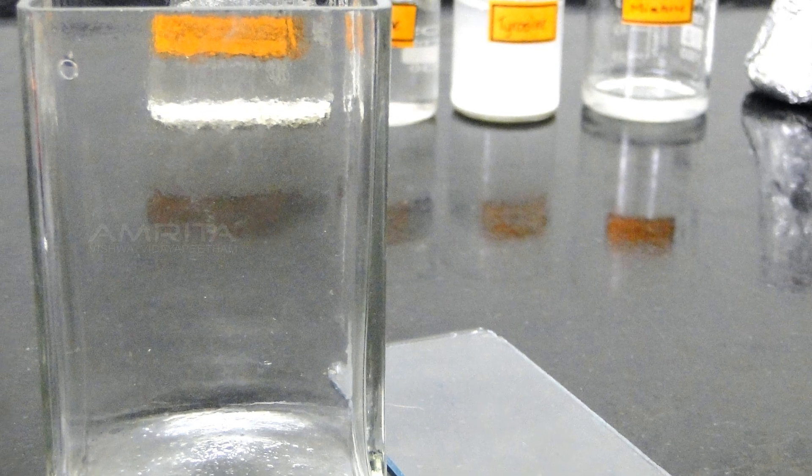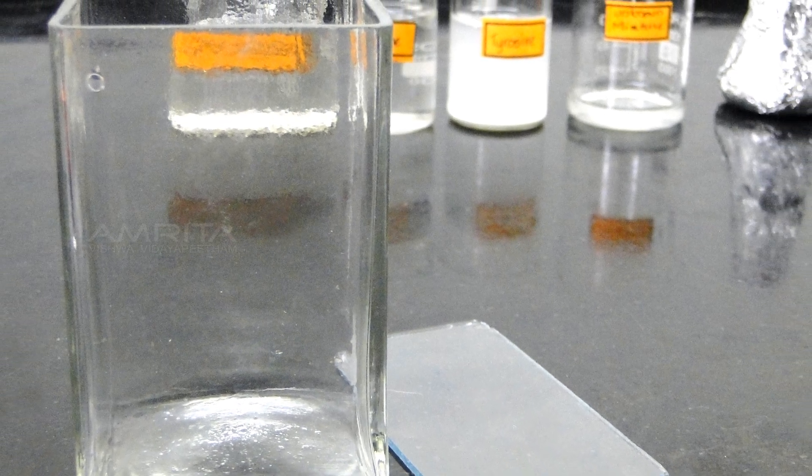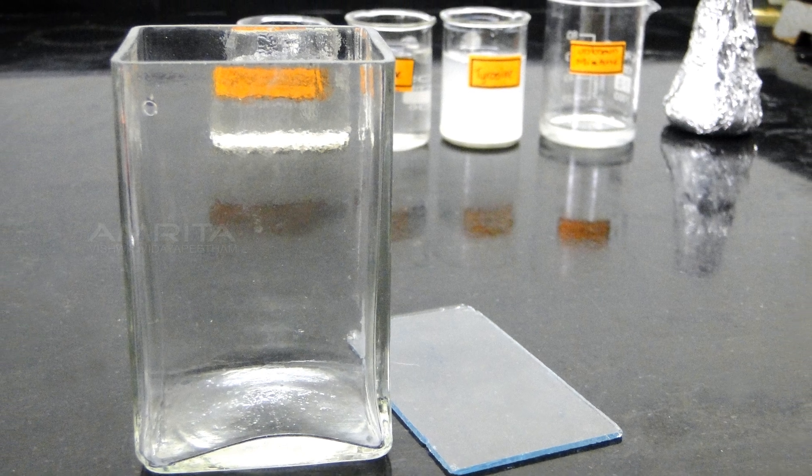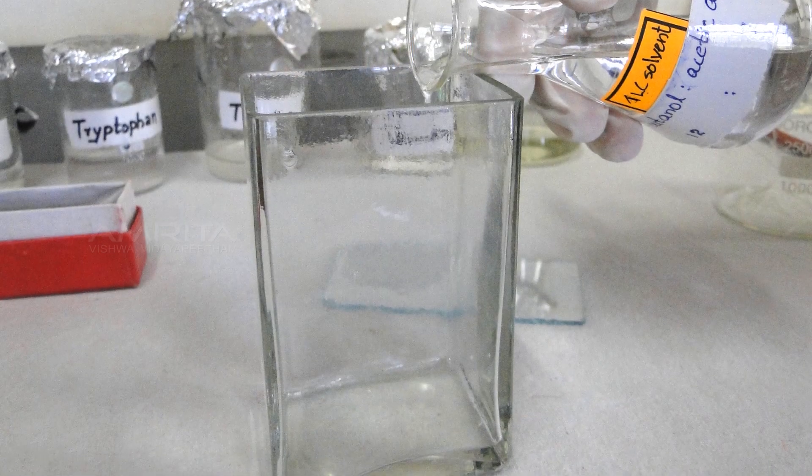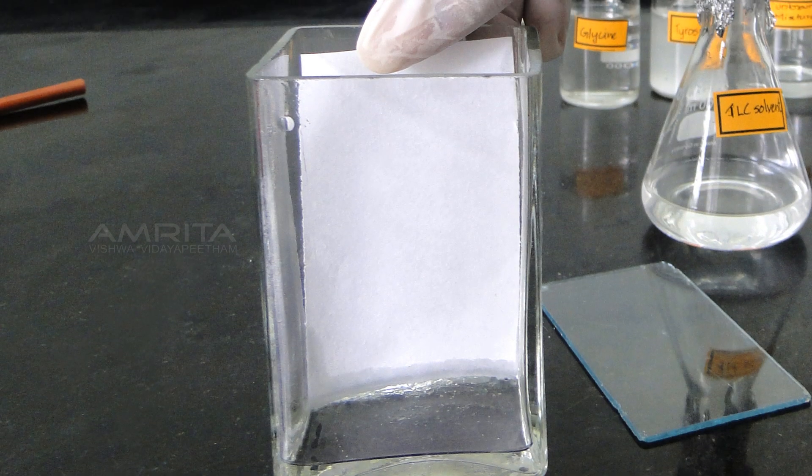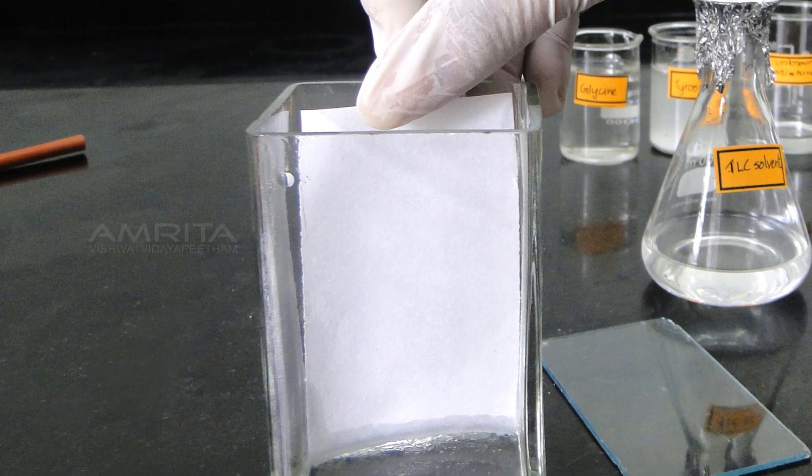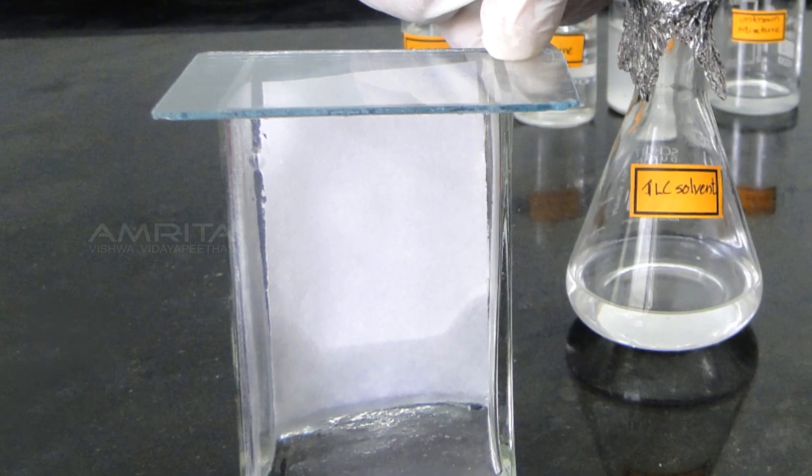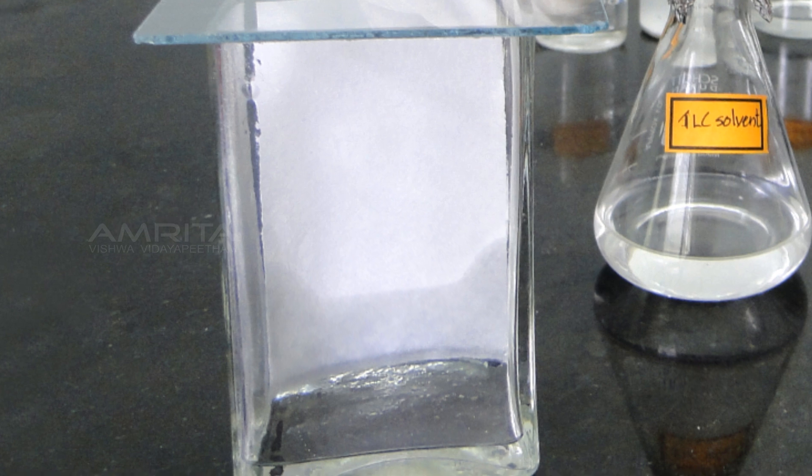Developing a TLC plate requires a developing chamber or vessel called TLC chamber. This can be as simple as a wide mouth jar. The chamber should contain enough solvent to just cover the bottom. It should also contain a piece of filter paper or other absorbent material to saturate the atmosphere with solvent vapors. Finally, it should have a lid or other covering to minimize evaporation.